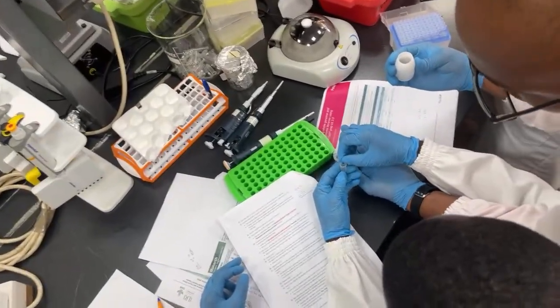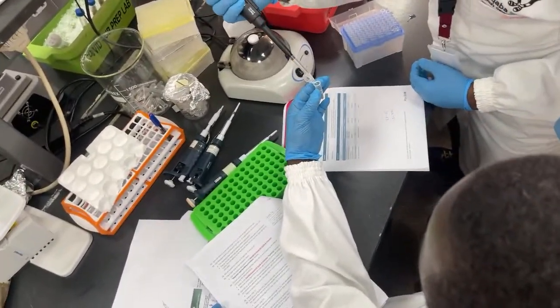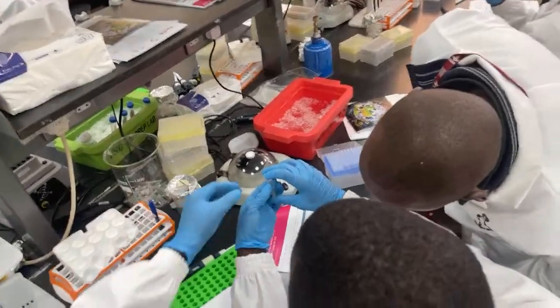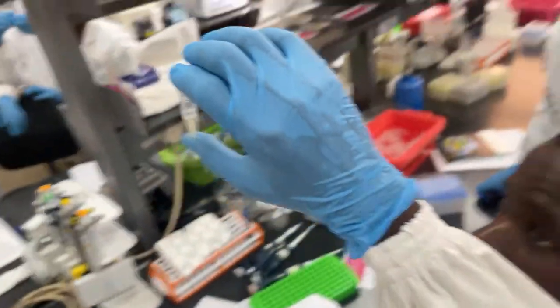Is it okay if you touch it there like that? Yeah. You'll see it start wrapping around the DNA. You see the DNA start wrapping around the disk? You see? Okay.